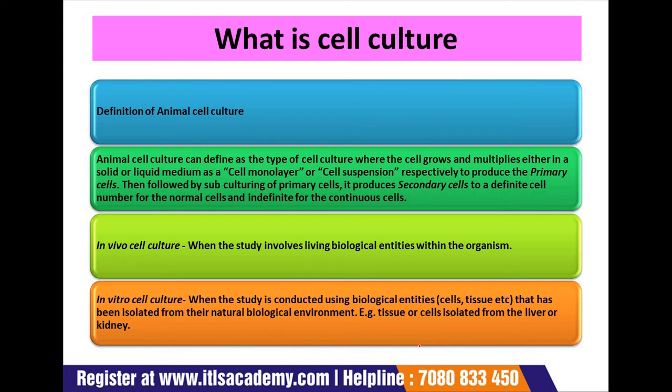Now, we should know about the cell culture. Actually, what is the cell culture? Cell culture refers to the process by which cells are grown in a controlled artificial environment. Cells can be maintained in vitro outside of their original body by this process, which is quite simple compared to organ and tissue culture.